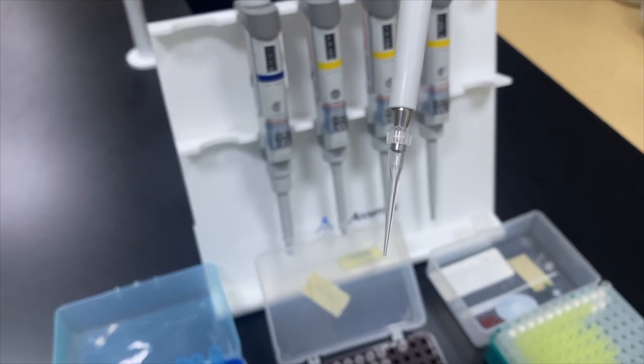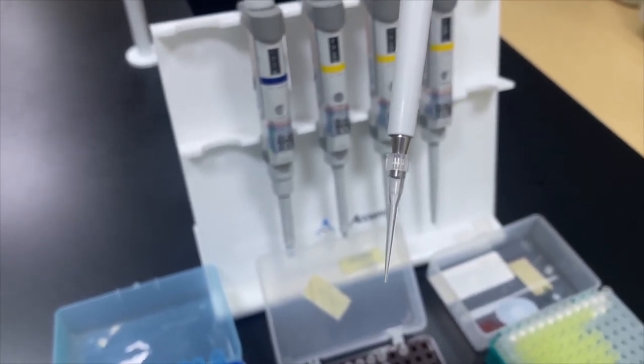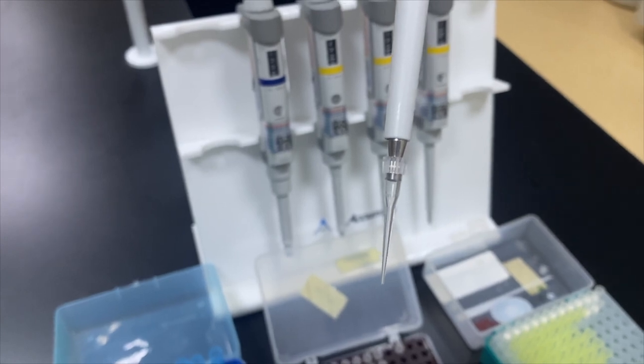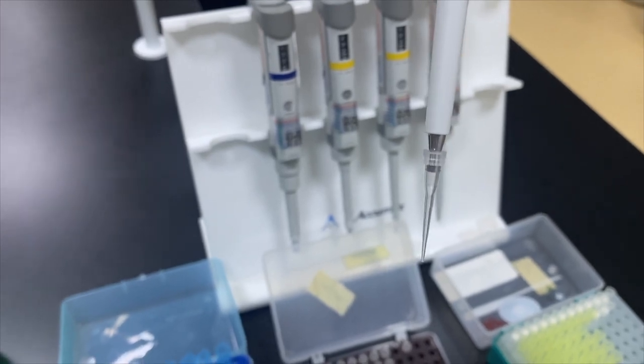Because there is a small tip, so that's why the edge of the micropipette should be in metal. Because if it's not in metal, it will break if we push too hard.